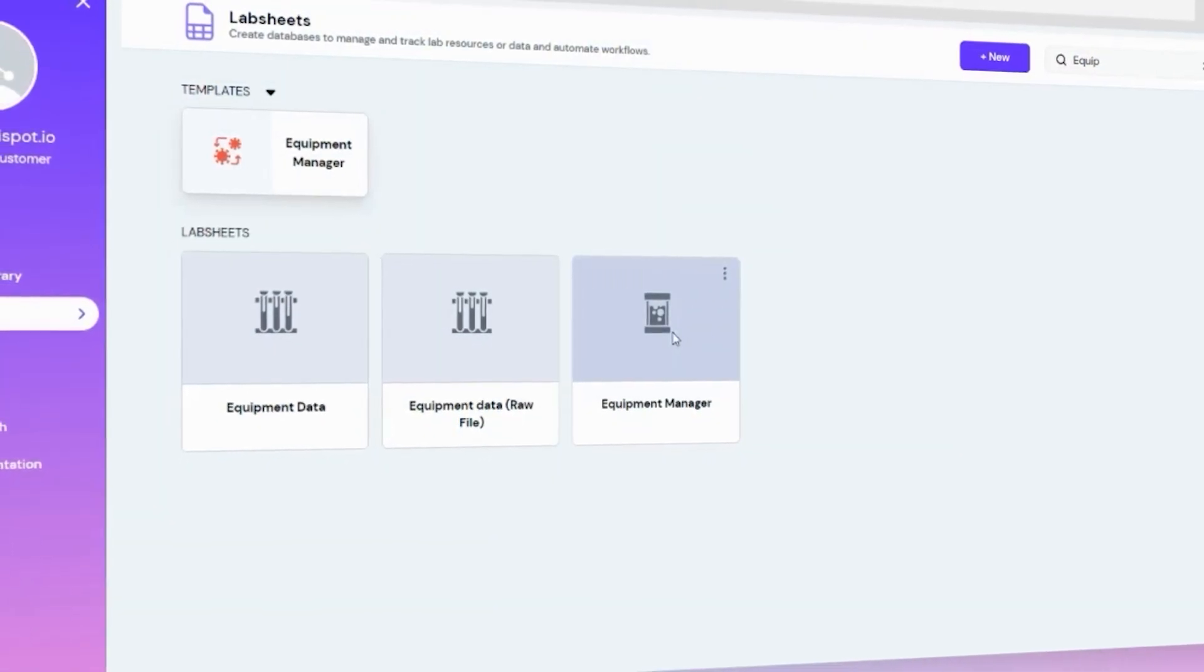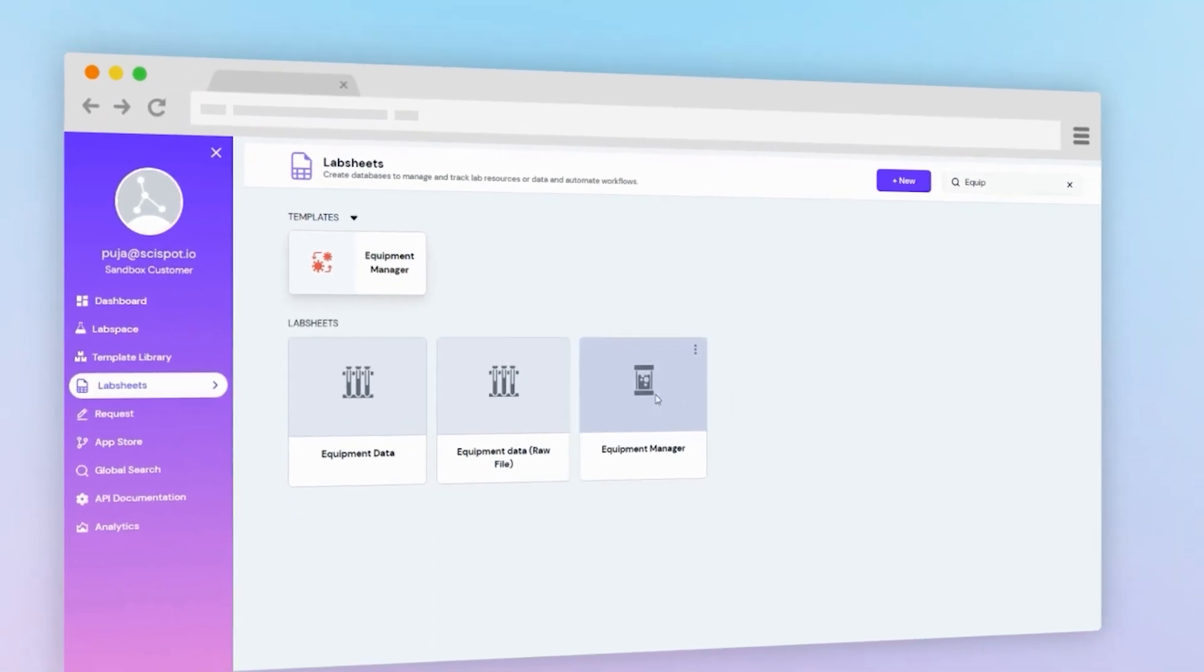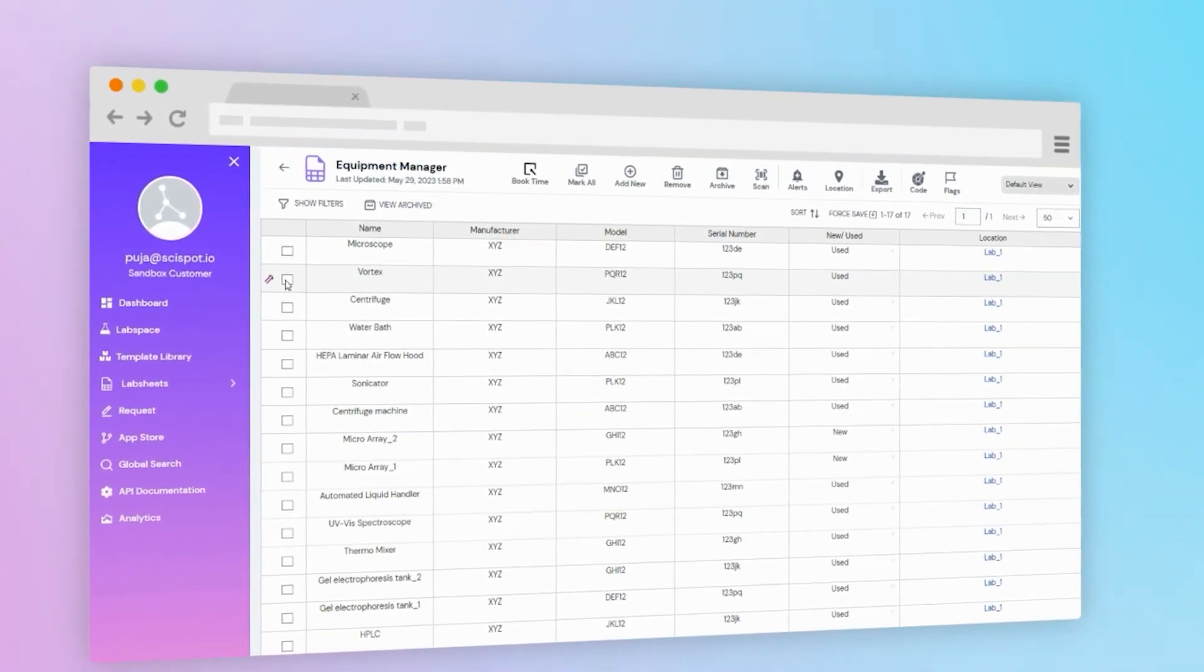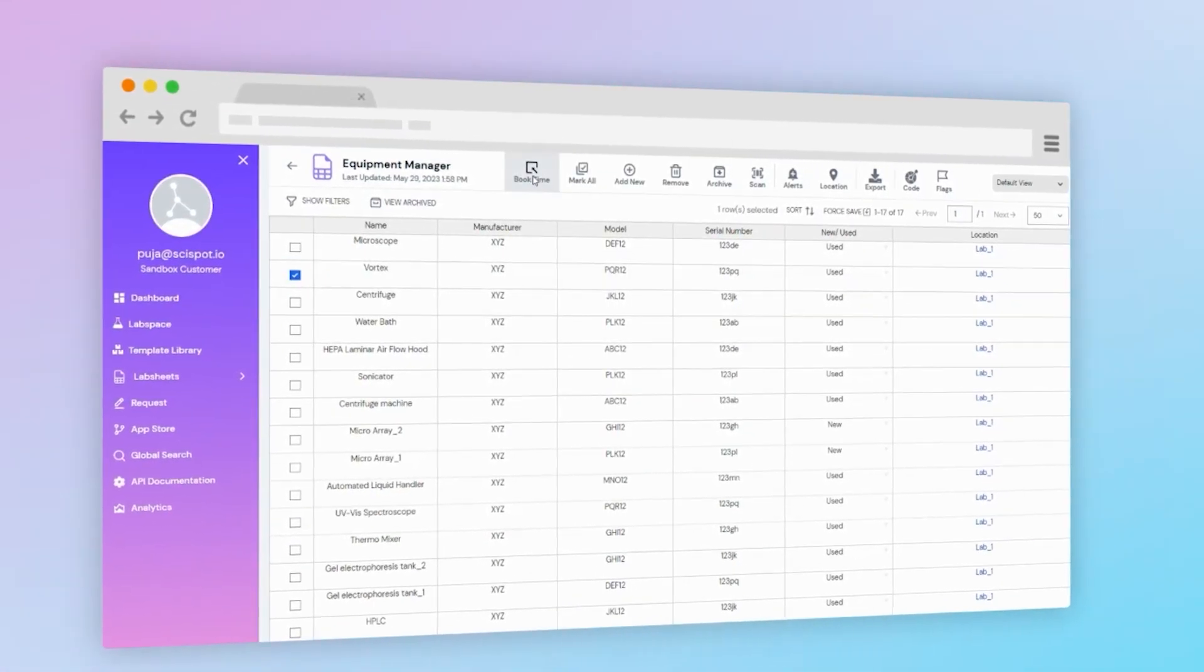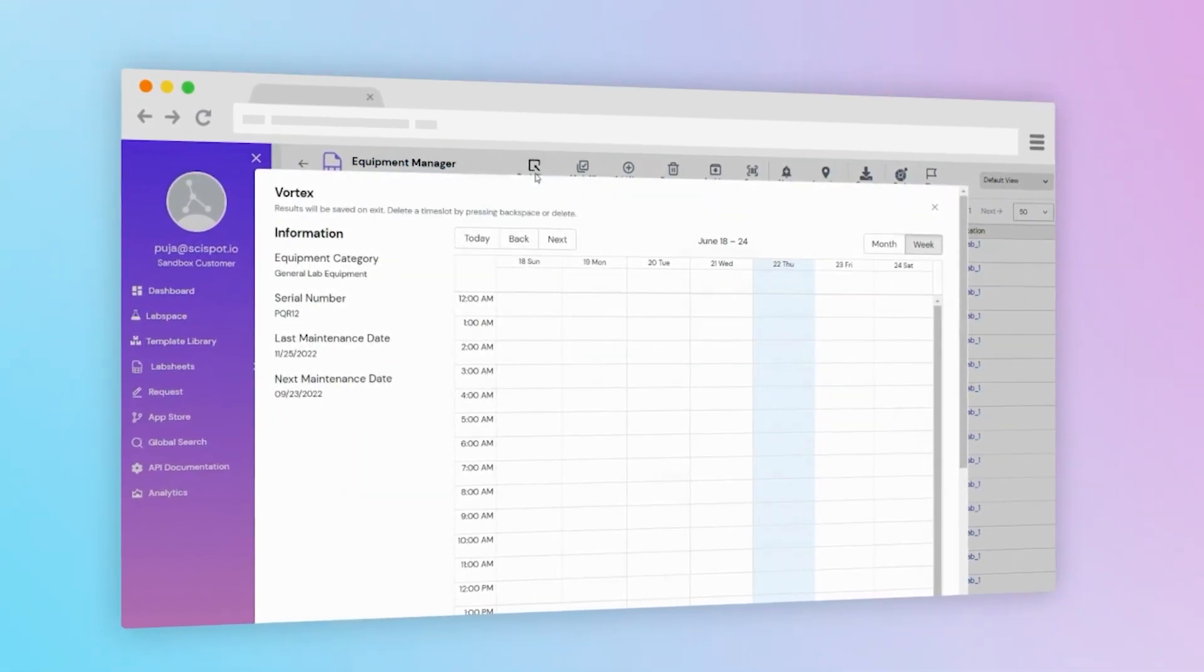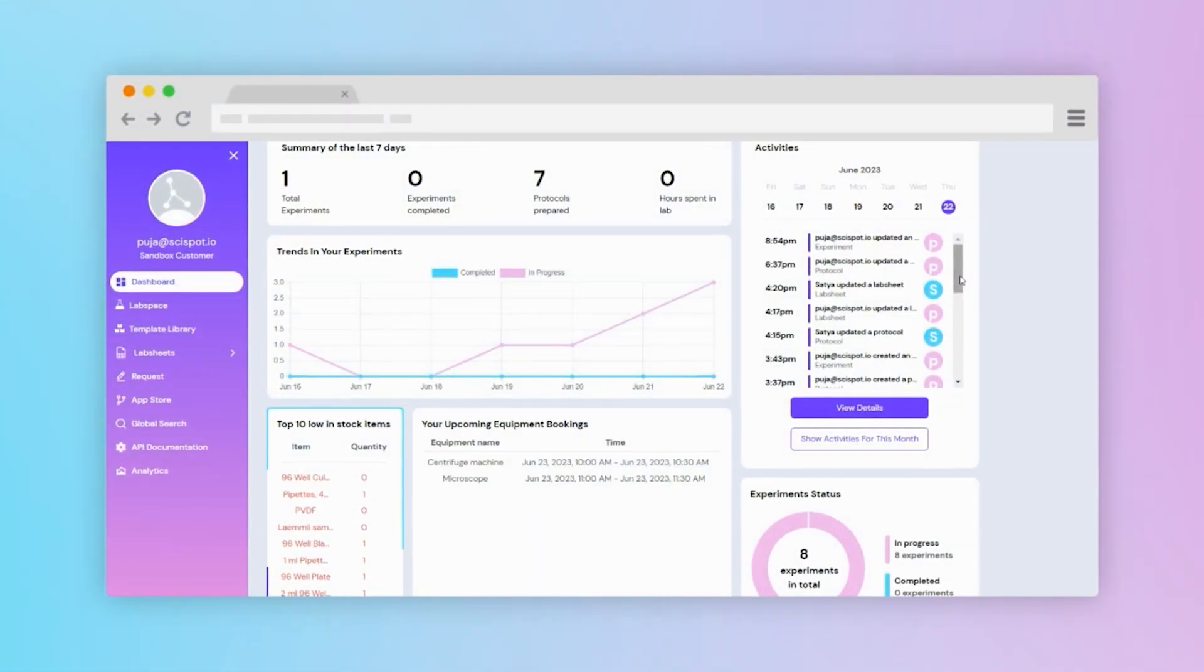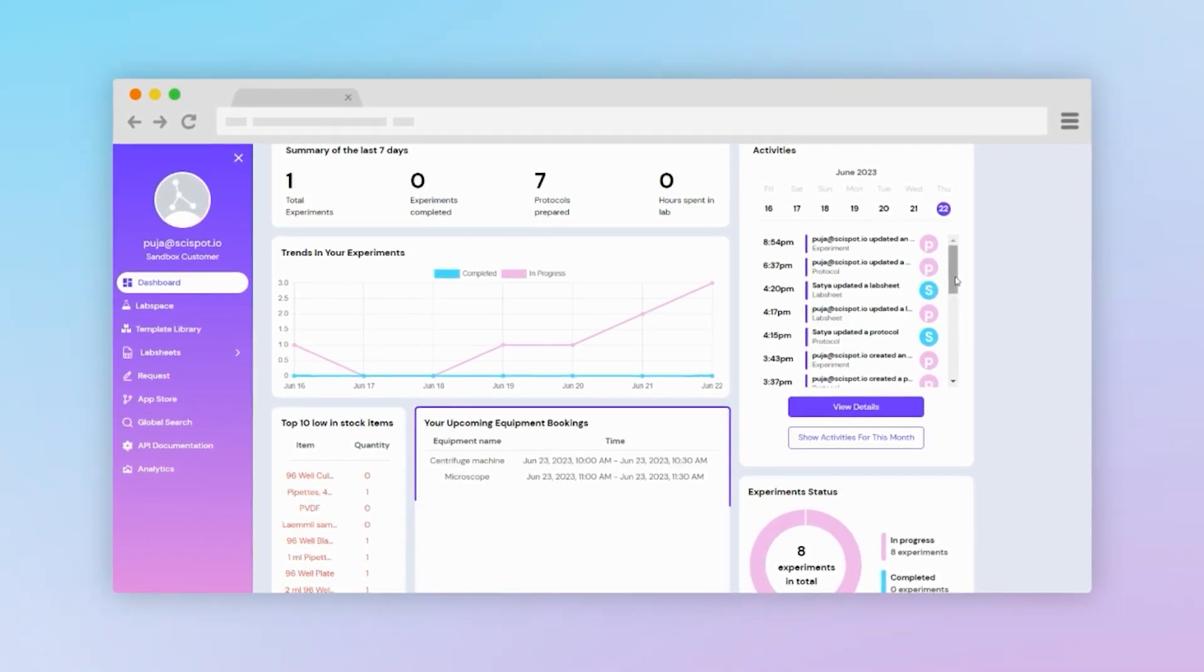The Equipment Manager seamlessly integrates with the platform's calendar feature. Users can easily select and book equipment directly from the interface. All bookings and availability will be reflected on the dashboard.